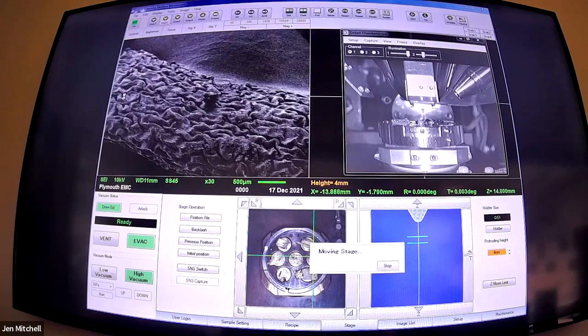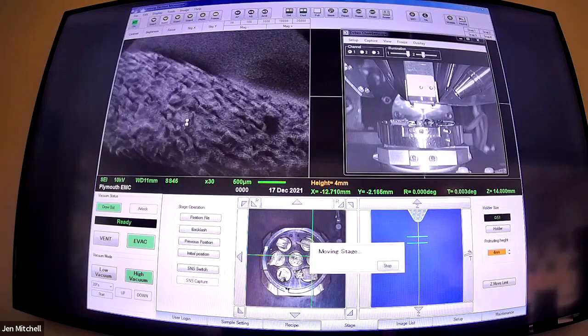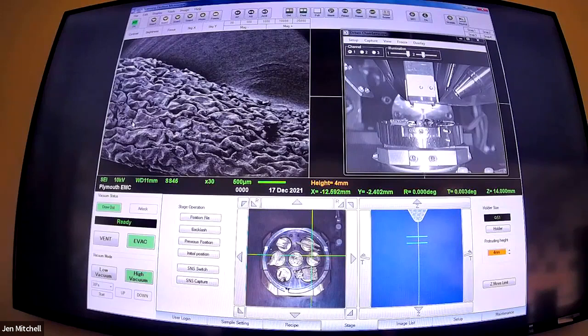We've got numbers one, two, four, and five left. If we have any preference, otherwise I will pick something. Five - we're on five. All right, zoom across, watch the stage swing by.